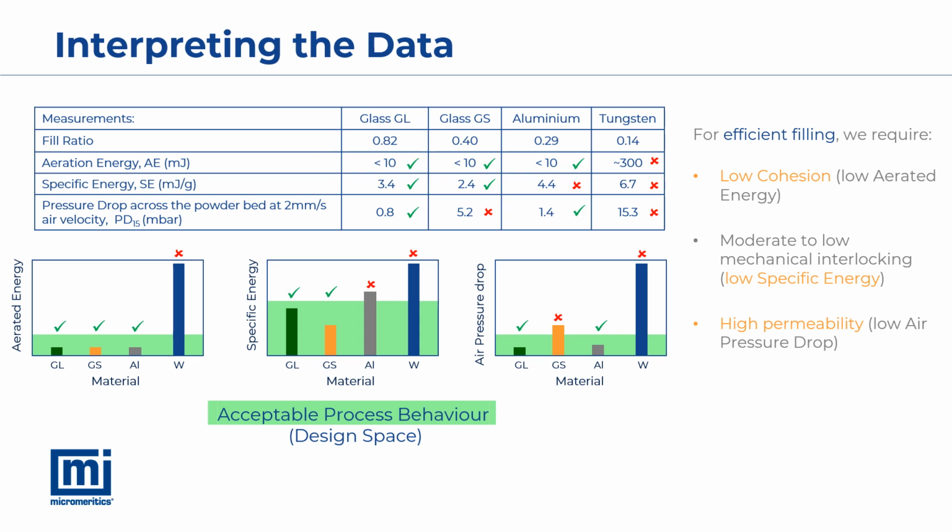We now have a set of tests and a range of acceptance criteria which we can use to screen any proposed new powders for acceptability, and we can also infer the reasons any rejected powder might not be suitable.